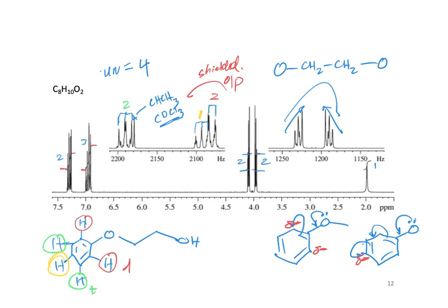Okay, yeah. Just to double check, both the green and the red protons have magnetic non-equivalence. Yeah, I think so, because look at especially the one in green, because it has all this small stuff. It looks kind of odd, right?